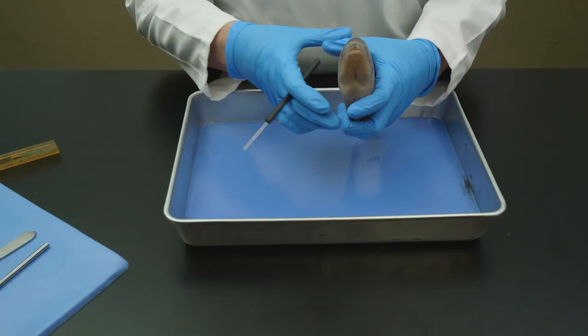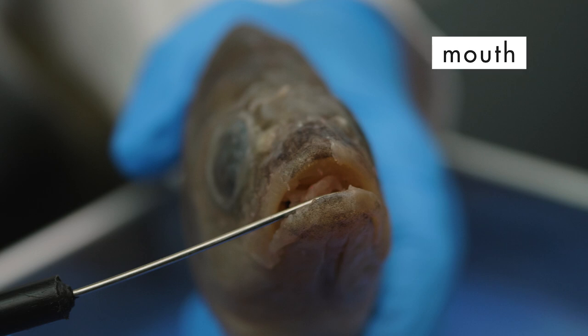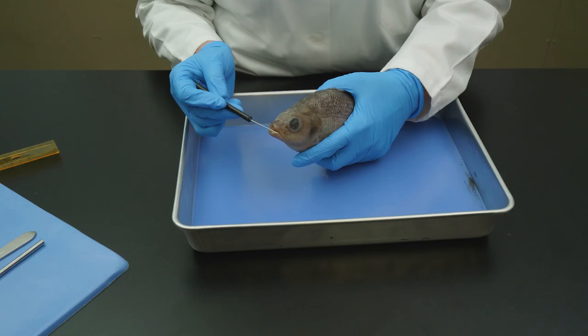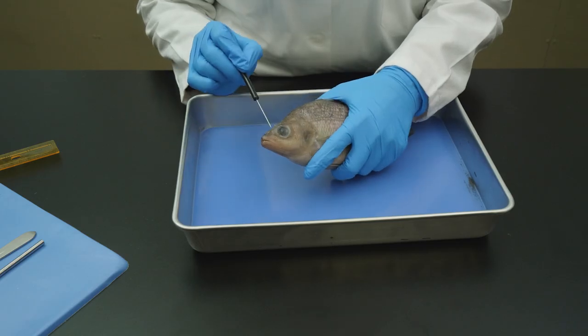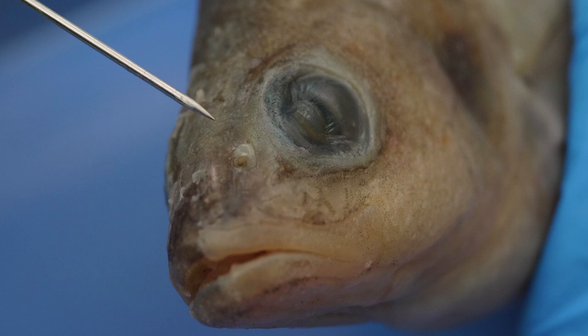At the anterior end of the fish is its mouth. A bony fish uses its mouth to take in water for breathing and to take in food for eating. Behind the mouth, on the fish's dorsal surface, are two nares. A fish does not use its nares for breathing, but it does use them for its sense of smell. The perch has a well-developed sense of smell that allows it to detect minute particles or chemicals in the water.